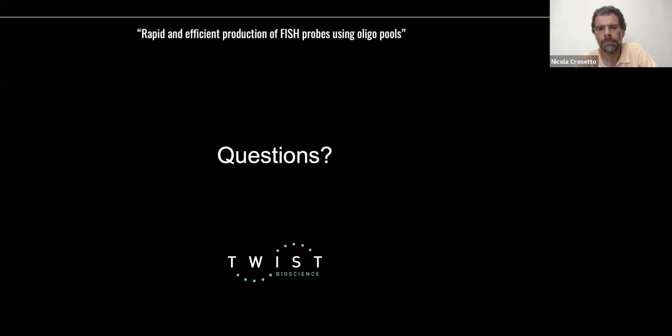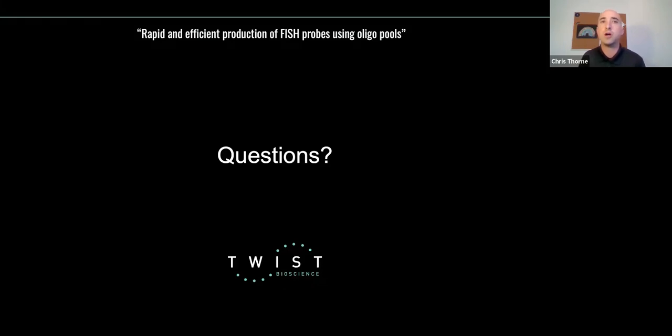Okay. Next question from James Ravelette. What would be the smallest target that you would feel confident in iFISH's ability to generate high quality resolution? For example, if you designed oligos against a 10 or 12 kilobase transgene, would this be large enough to yield decent resolution? Yes, absolutely.